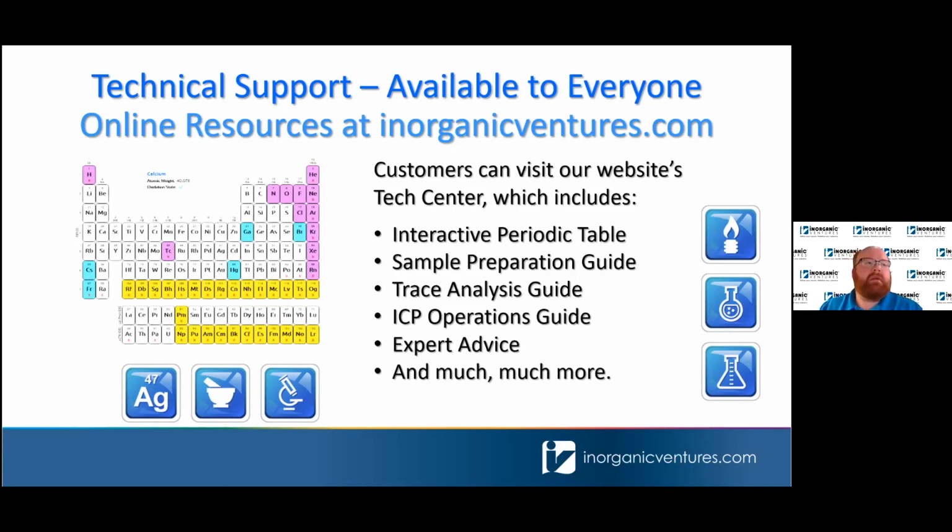Great, thanks. This is a general question regarding lithium. Is lithium a problem? Do we have washout problems for that element? I think yes, depending on the instrument you're using. On an OES, I would say no. It isn't specifically sticky. But if you're using mass spec, I've seen lithium get left behind, and I think it's in the lenses of your ICP, but not your intro system.